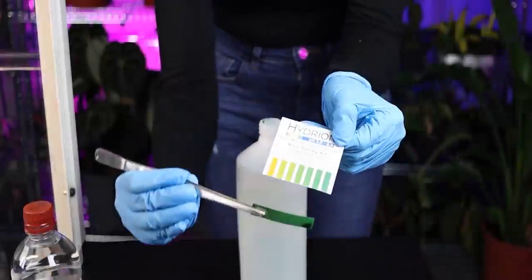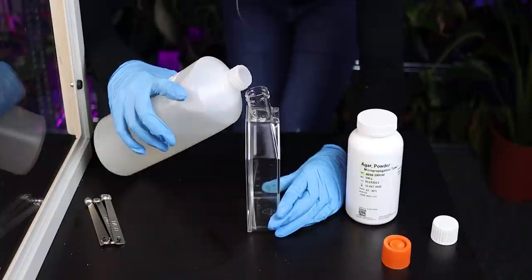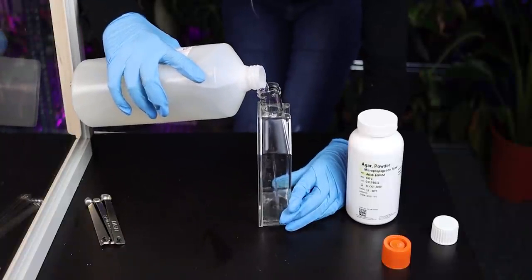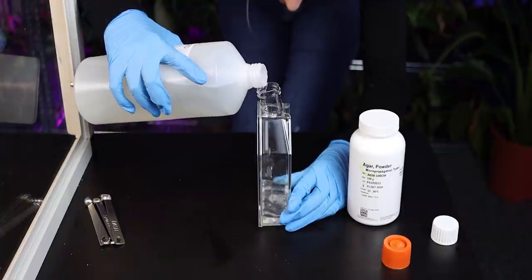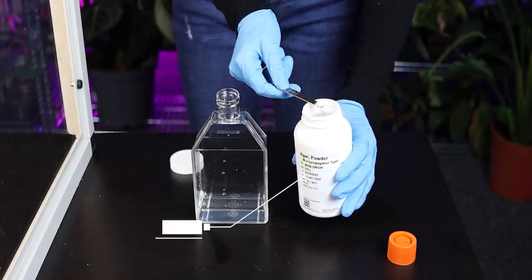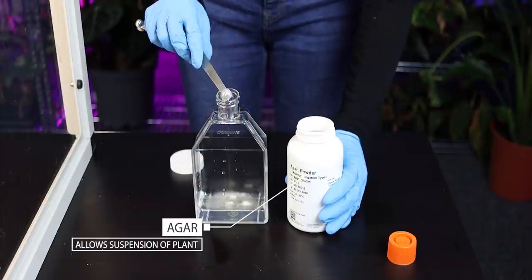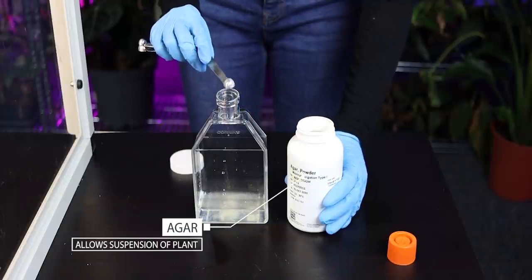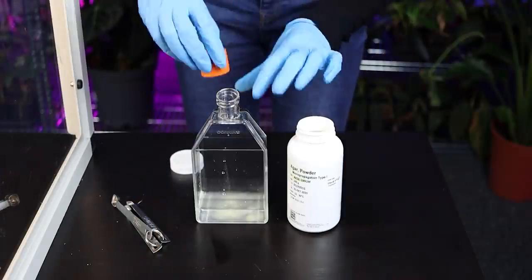I'm checking the pH again, and as you can see, we've raised it just enough for it to be acceptable. Now that we're good to go, I'm measuring around about 45 milliliters of our prepared solution into our tissue culture container. To this, I'm adding agar, which is basically a vegetarian gelatin substitute produced from a variety of different seaweeds. This basically makes the medium firm and allows the plant material to be suspended.